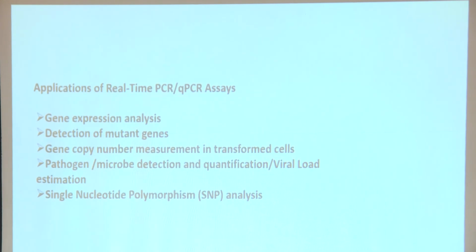Of course, these are some of the applications. We have gene expression analysis, detection of mutant genes, copy number, pathogen and microbe detections, and of course single nucleotide polymorphism, and many more promises are there in real-time PCR.